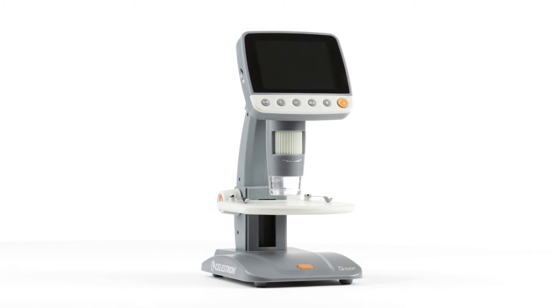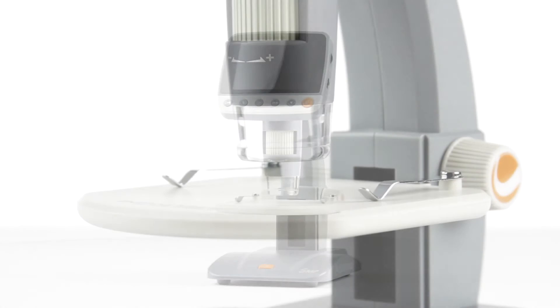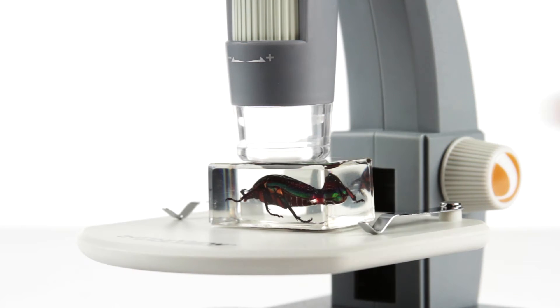What will your next microscopic discovery be? With the versatile InfiniVue Digital Microscope, the possibilities are endless. InfiniVue is a customer favorite for examining 3D objects like insects, circuit boards, and forensic evidence.